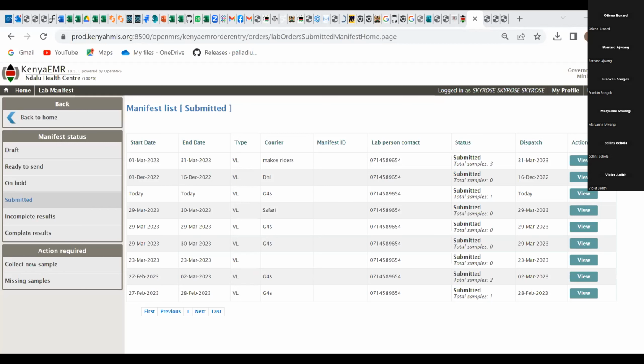So my advice would be that whenever you hit such errors, kindly just reach out to our service desk, where we will be able to look at the exact issue and advise you accordingly, or help you resolve. But most of the time, 400 and 500 are associated with the HTTP.